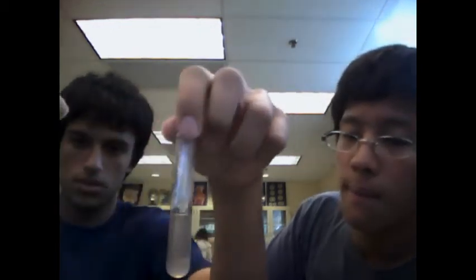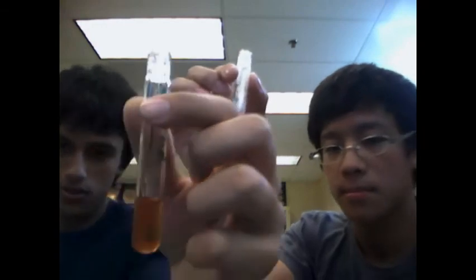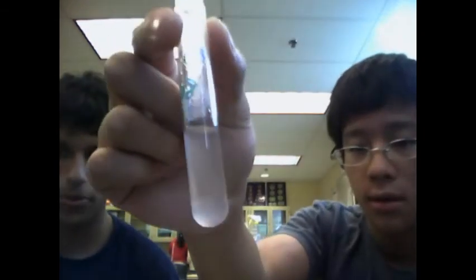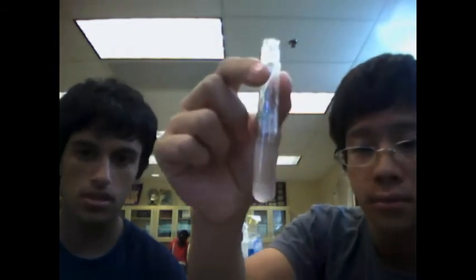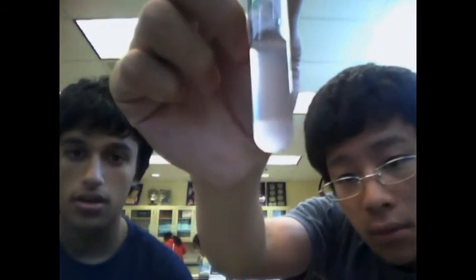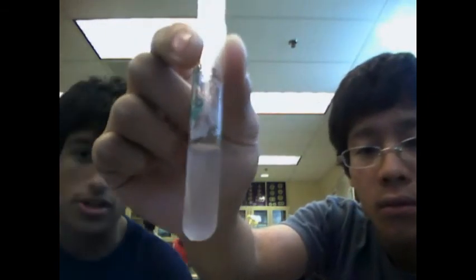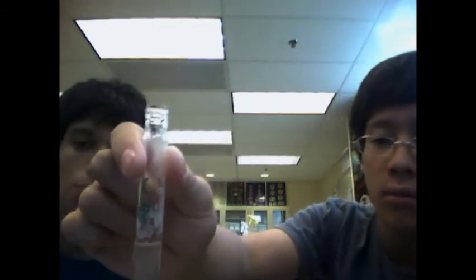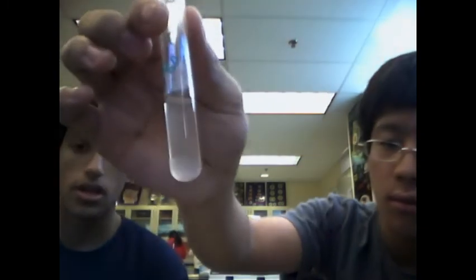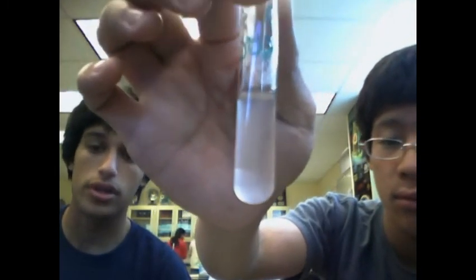And now, compared to test tube number 3, positive control, test tube number 3. As we can see, precipitate at the bottom, and almost no brown. Very, very light, and it's hard to see, but there is very little brown benzoquinone. So we can see that at 80 degrees Celsius, the enzyme was greatly denatured.